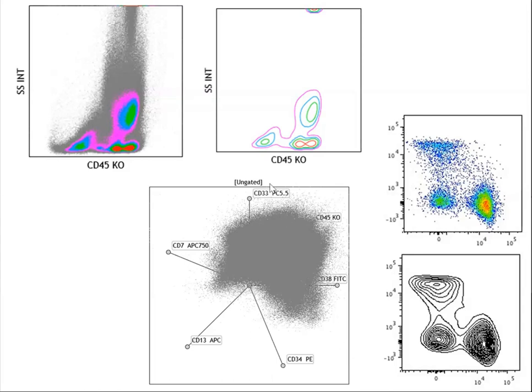We don't use it regularly during our analysis. But when you want to present the data somewhere, say for example, you want to publish your data or show your data at a conference, in that case you can use this. You need to use this because nowadays papers and journals want you to present your data in much higher dimensional forms. So for that, this can be useful. This is called a radar plot, not much used during our routine analysis.